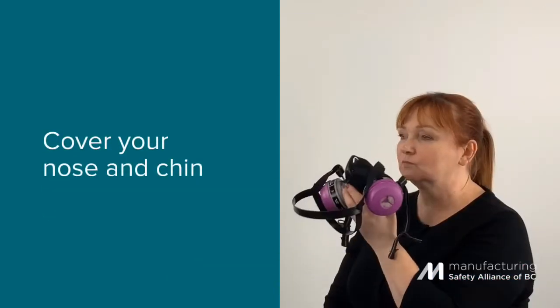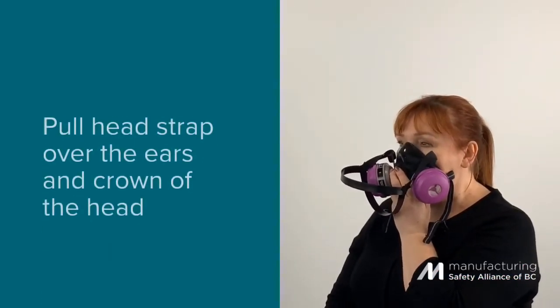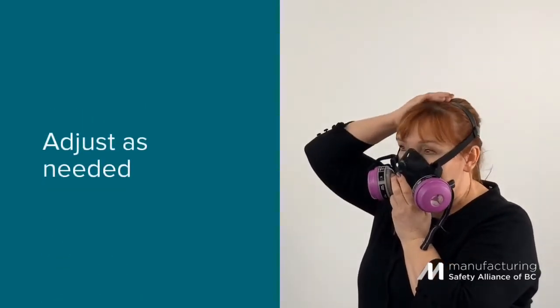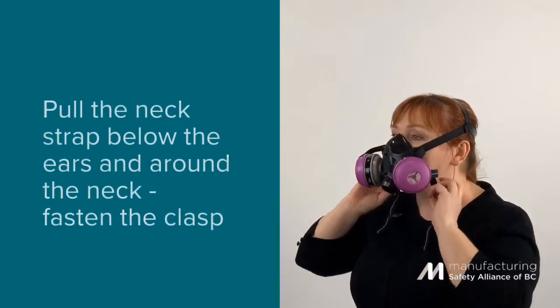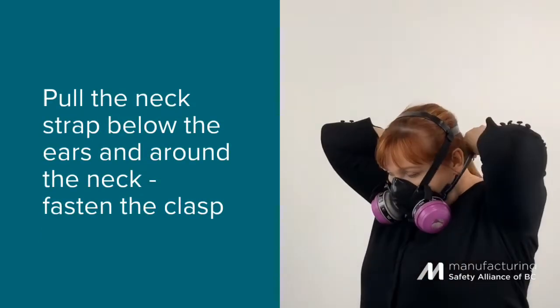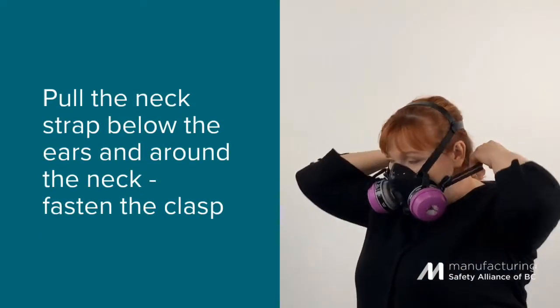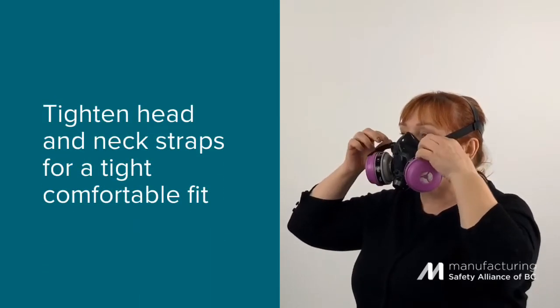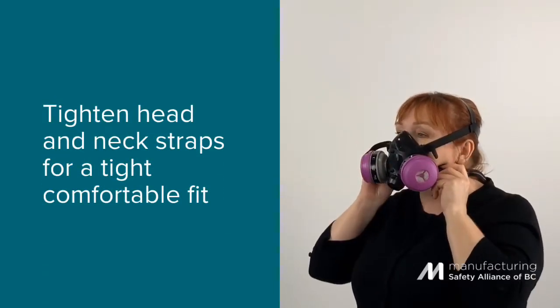Place the respirator over your nose and chin and take the head strap over your ears and over the crown of your head. Adjust as needed. Take the neck strap and place below your ears and around your neck. Fasten the clasp of the neck strap. Tighten the head and neck strap as needed until a tight, comfortable fit is achieved.